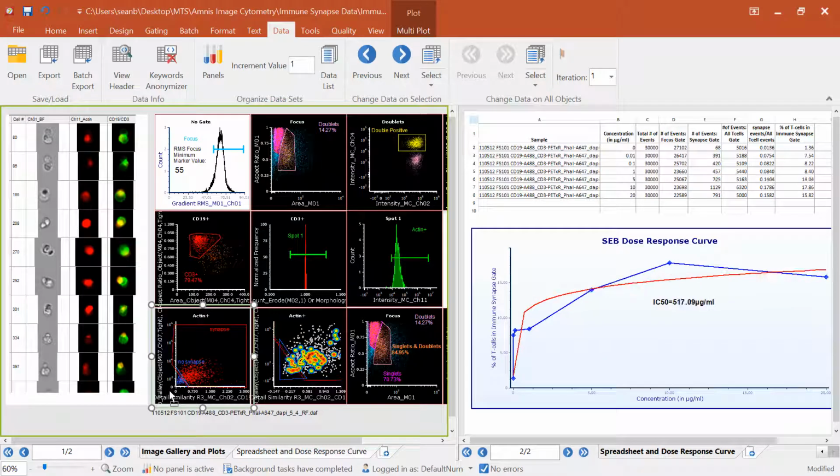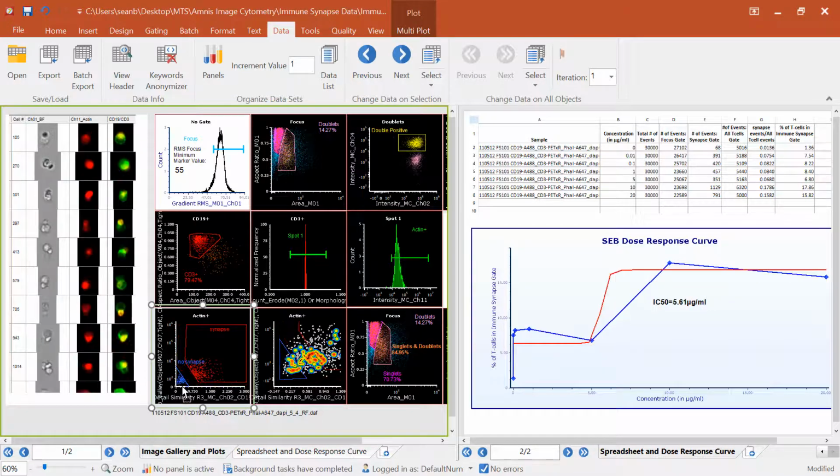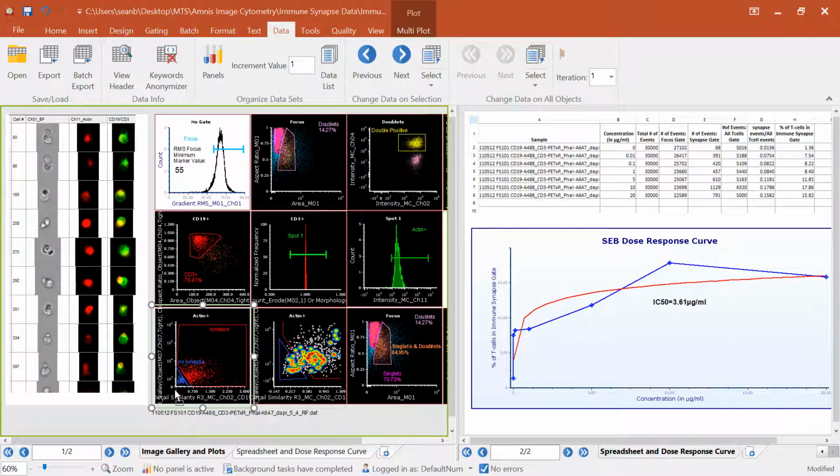And I can really figure out in real time here what's going to happen if I exclude outliers, right? What's going to happen if I change this gating position? Remember, this isn't a tool to make your data better fit your gates or make your gates better fit your data, but it's a tool to help you prevent having to set a gating position, copy and paste out to Prism, decide that the IC50 curve isn't so great because of one of the data points, and then having to do that all over again. Again, what we get here is the ability to move these gates, see what's going on with outliers in real time, and make better decisions as a scientist with the data that we have at hand.